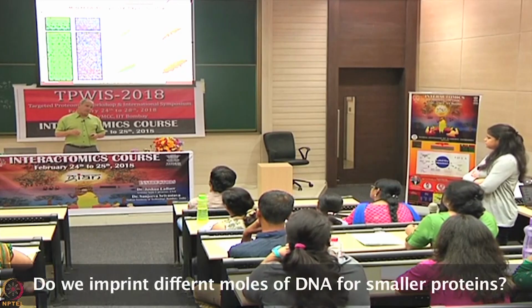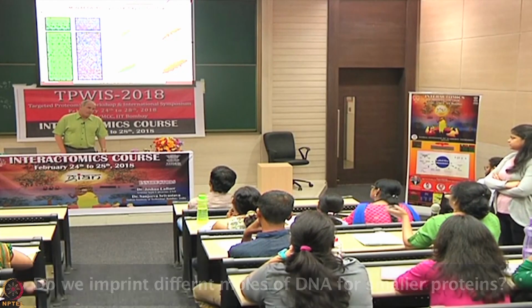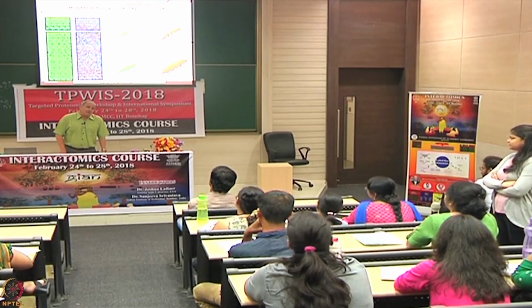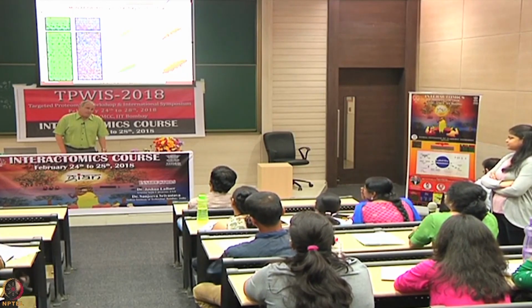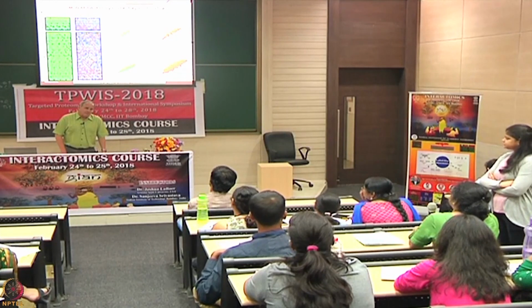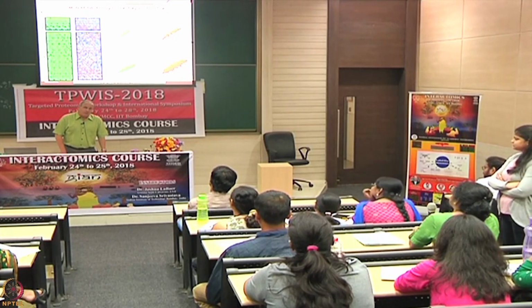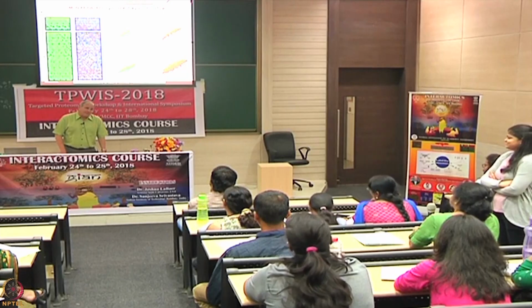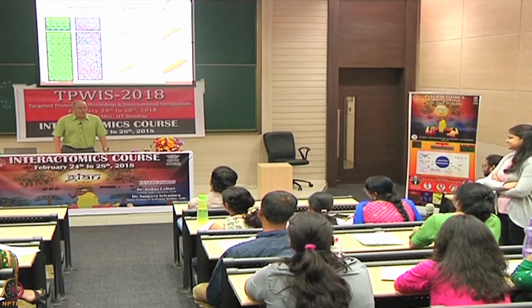What if we put more DNA for the small size proteins and less for the larger ones? Technically, if you look at the molarity of the different DNAs, there are more moles of the smaller genes. It was too complicated to figure that all out and adjust for that, and Xiaobo wasn't willing to do it, even though I suggested it. But it seemed to work okay.